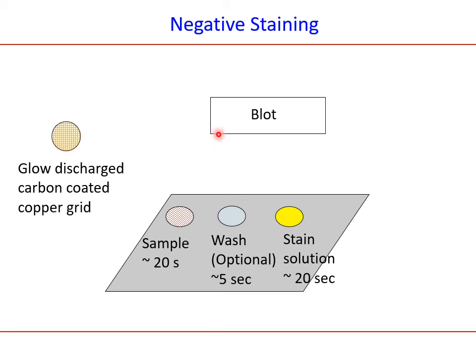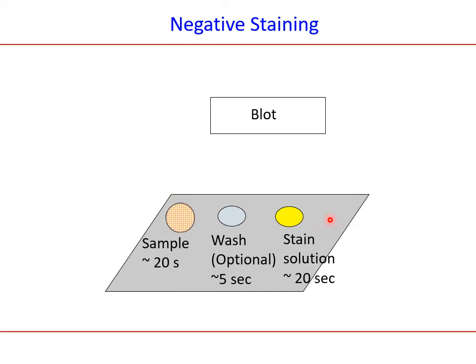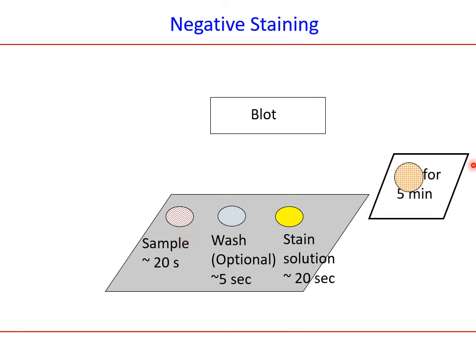The sequence is: the glow-discharged grid is placed on the sample droplet, then blotted, and before it dries completely it is moved to the wash. Remember: while moving from sample to blot to wash the sample should not dry completely. After the wash the same step is repeated — the wash is blotted and before completely blotting it is placed on the stain for about 20 seconds. After staining it is left to dry. The flow is: sample → blot → wash → blot → stain → dry.